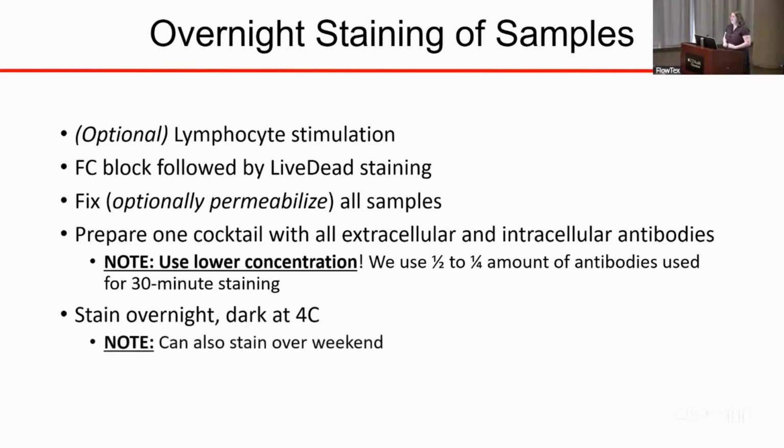And what I have found works as well is that this can also stain over the weekend. So I can apply the stain on Friday and come in on Monday, and I don't have to ruin my Saturday by being at the flow core and cursing my PI.